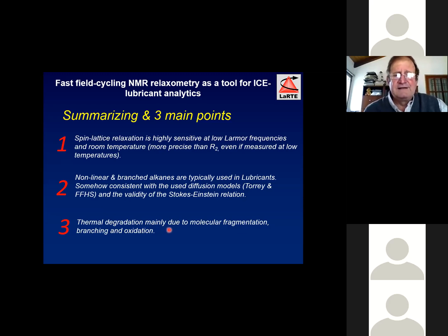However, the model we have is already good enough, and I really don't know at the moment how far we can go with a more detailed model for such kind of samples. Okay, so it seems that relaxometry will finally have a limitation at this point.